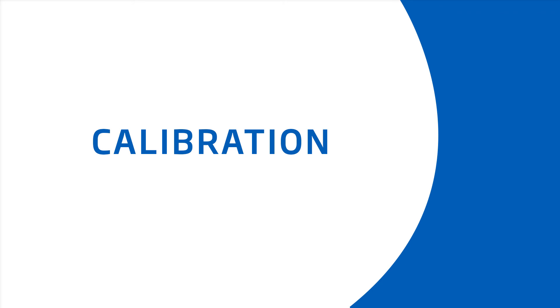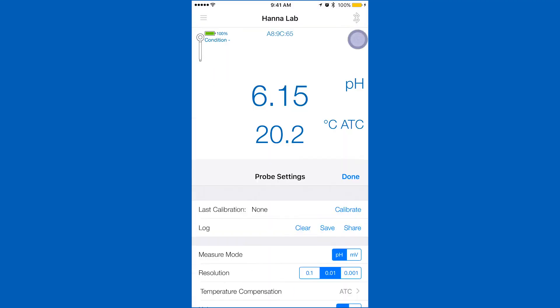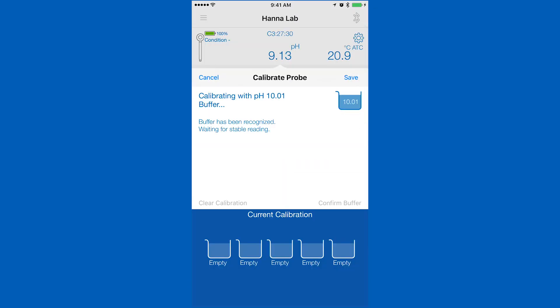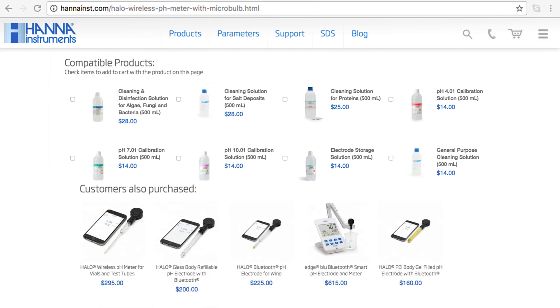Calibration is an important part of keeping your Halo operating at its best. We recommend calibrating before each use. To calibrate your Halo pH meter, go into the settings menu. Tap calibrate and you will be taken to the calibration screen. Your Halo can calibrate up to 5 points that are automatically recognized. You can find all the calibration solutions you need right on the product page.